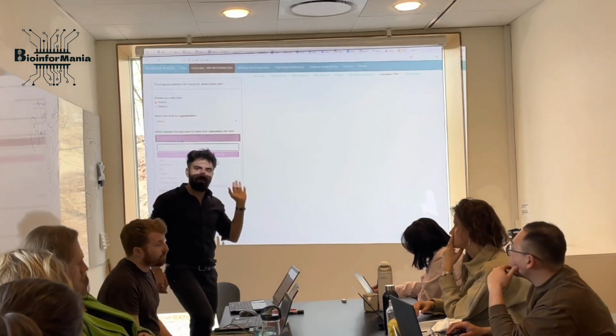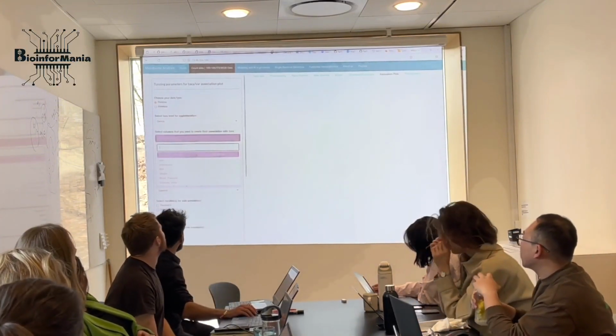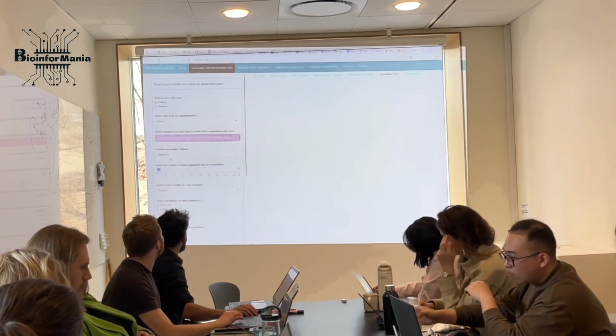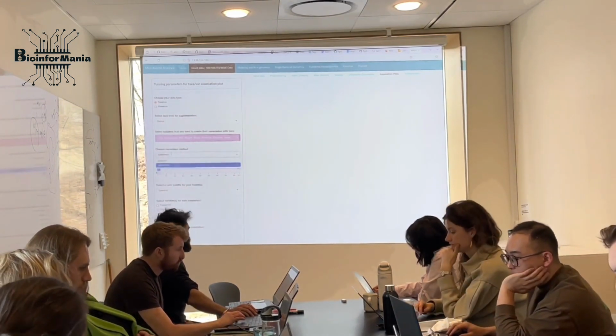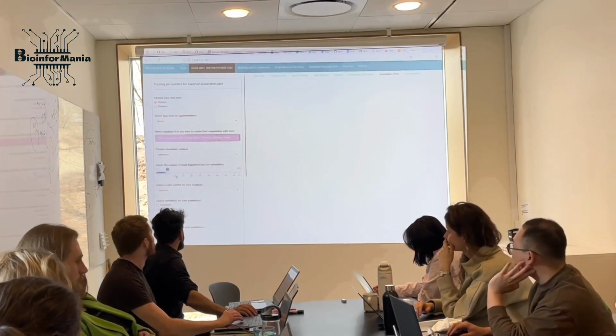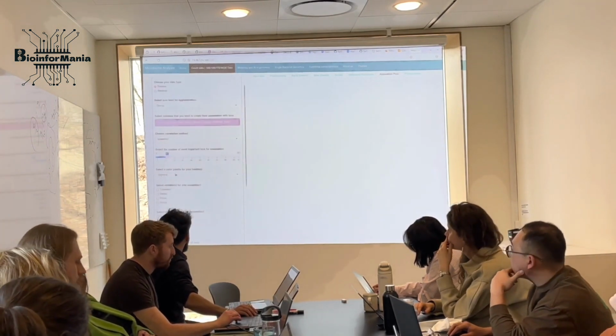And I looked on Google for the range of them, so it's not very off. You select all or select only one of them, so all of them have been selected. Then you can choose Spearman or Pearson correlation. Then here you can see the number of most important taxa for the association plot. And then down here, color, whatever.